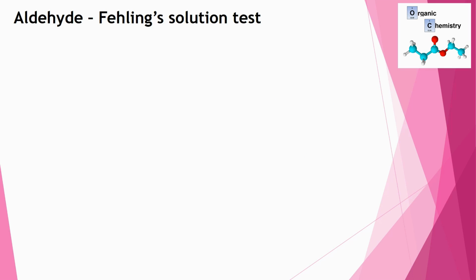Okay, let's look at Fehling solution. Sometimes people use Benedict solution, or they say that they're adding Benedict's when they're adding Fehling's. Fehling's is the solution that was developed by chemists to identify aldehydes, but the solution Benedict's that biologists often use can be used just as easily.